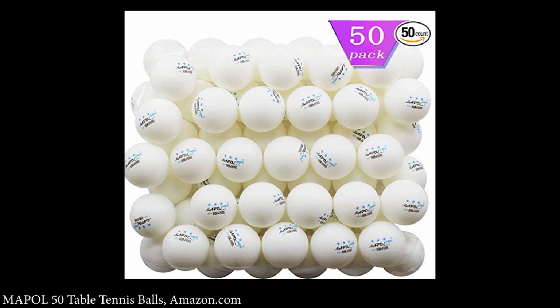And we're going to think about little particles of dust that are being forced to sort of float or move between those particles. Okay, as our little bits of dust move between the cannonballs, versus moving between the ping pong balls, think about the openings between the cannonballs and the openings between the ping pong balls. As a little piece of dust moves between them, for which packed sphere are they more likely to touch a solid surface? Well, the ping pong balls. They're going to run into the ping pong balls a lot more often.